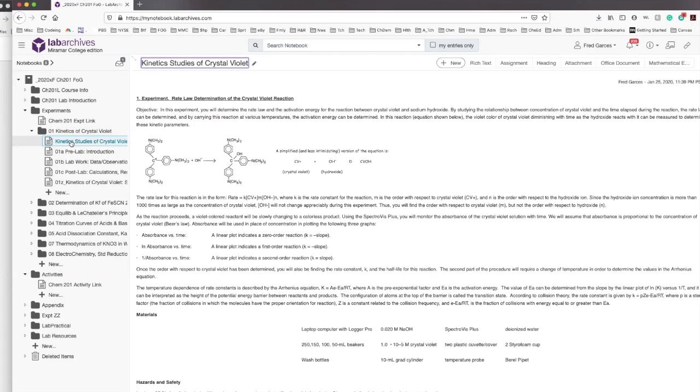Okay. And then when you go to, you don't do anything on that page. That page is purely informational. Okay. And you have that same page in your lab manual, or if you download the lab manual, it's the same page. Okay. I just decided to put it here so that everything's contained in LabArchives. But this next part, A, B, and C, are the heart of your write-up. You click on A, that's your intro.